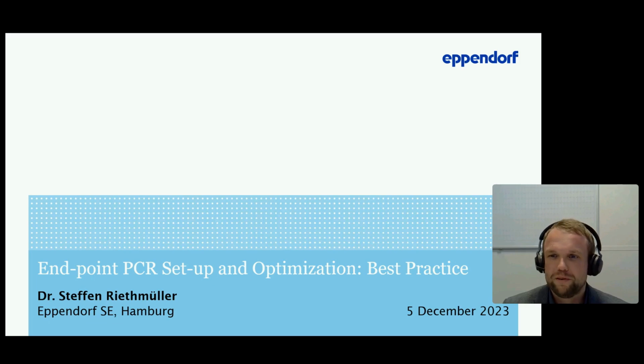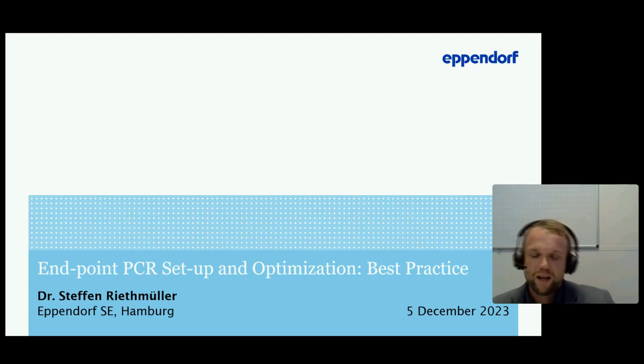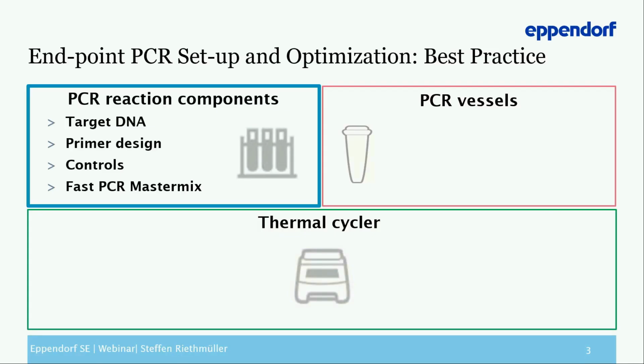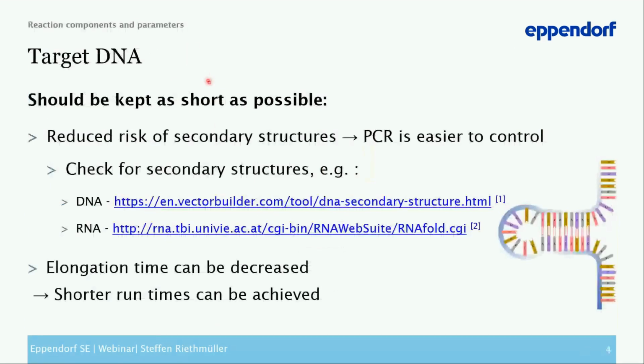Thank you, Tom, for this nice introduction. And hello, everyone, to today's webinar. It's my pleasure to talk about endpoint PCR setup and optimization. And with this, let's just start. Today's talk is divided into 3 sections, and the first one will deal with the PCR reaction components.